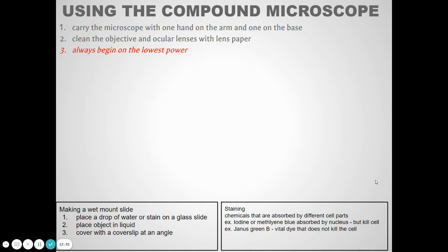If you ever use the other microscopes, you kind of move the slide with your fingers, and sometimes you'll go way too far, and then you have to come back. These little knobs make it very easy to make small, tiny adjustments. So these are really nice tools to have. Not all microscopes have them. So you start on low power.